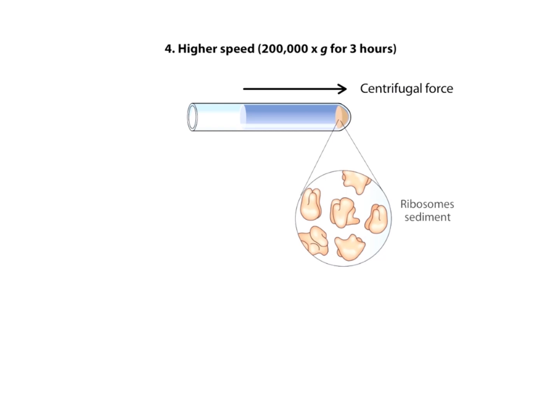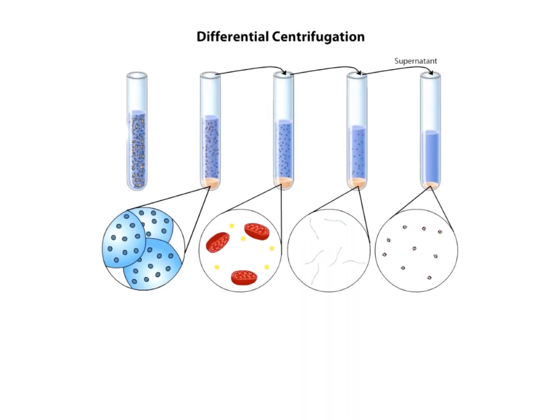In differential centrifugation, subcellular components are separated by their size and density, with larger and denser components sedimenting faster than smaller and less dense components. The fractions obtained from differential centrifugation correspond to enriched but still not pure organelle preparations. For instance, some smaller particles will be found in all pellets, considering some of these particles are already present at the bottom of the tube in the original homogenate.